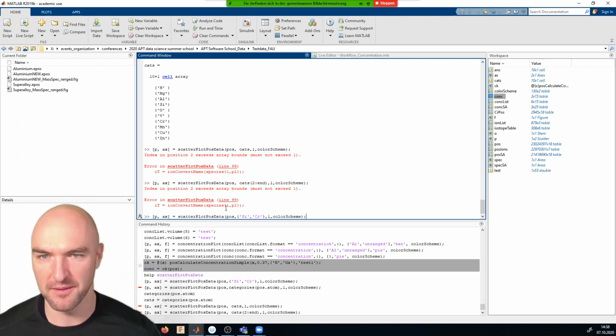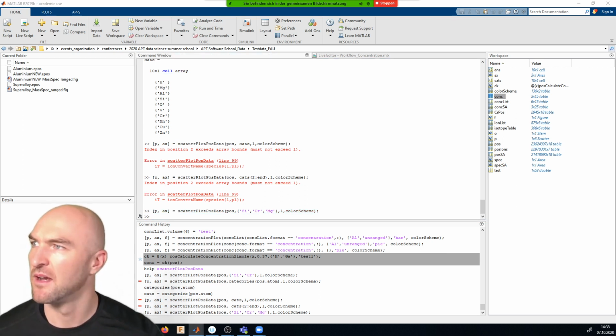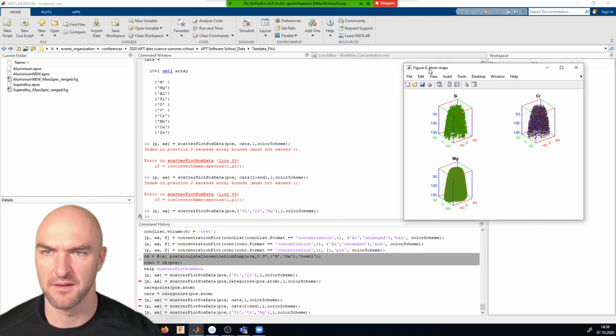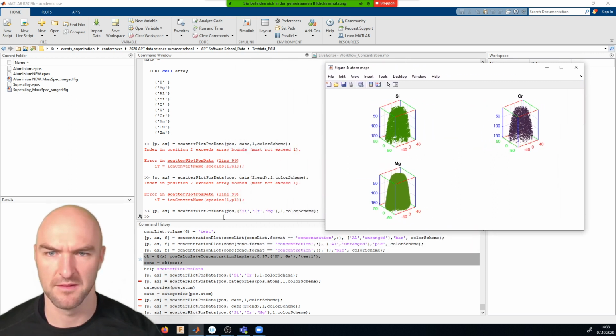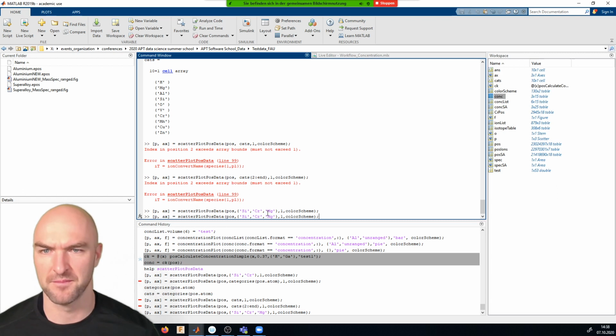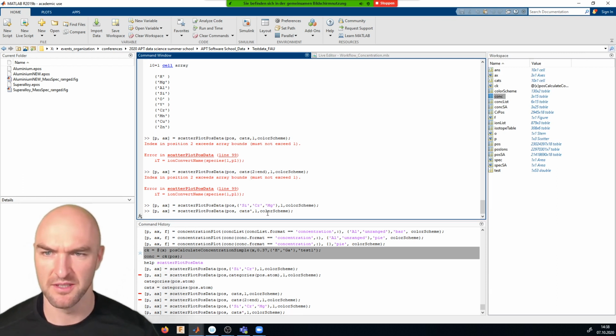Anyway, so maybe you try, because the cell array it created is going horizontal and the cat cell array is going downward. So you need to, I don't know the English word, I'm sorry, to transpose. Yeah, thank you. I don't think that should be the issue. It was the issue. Huh, interesting.